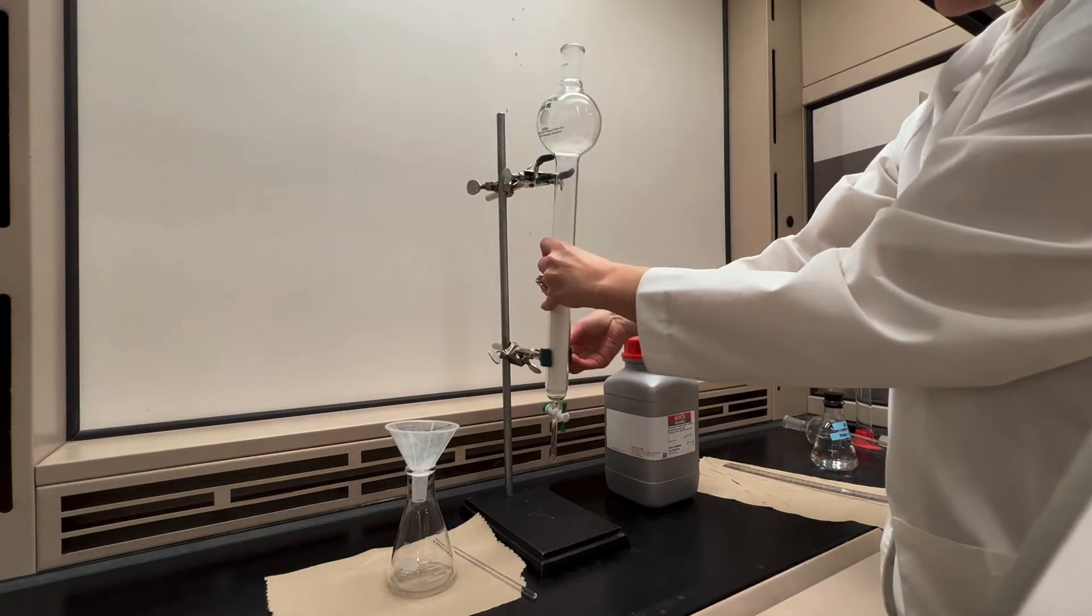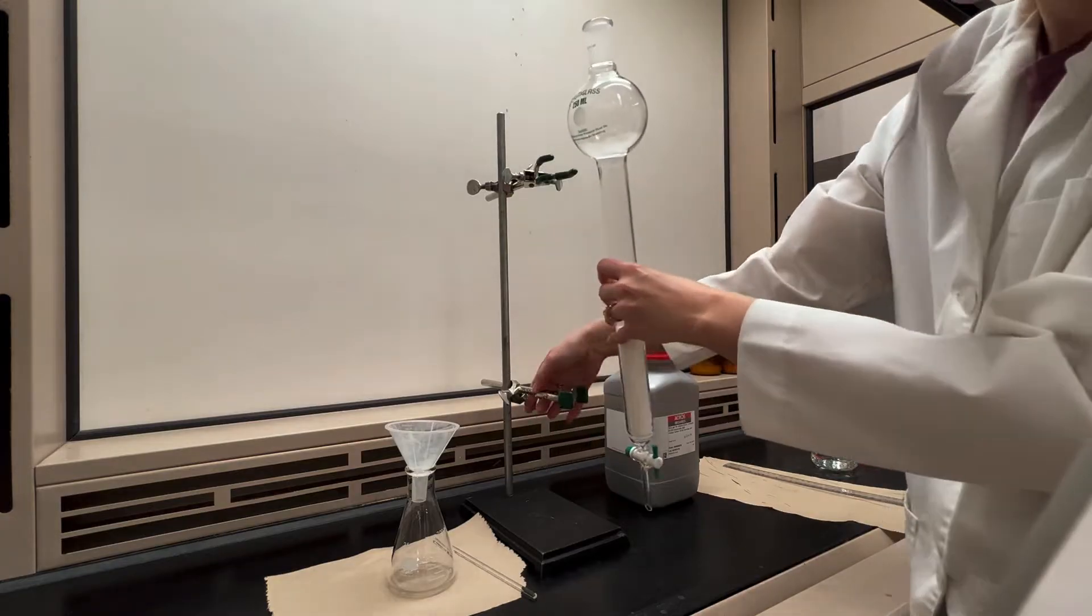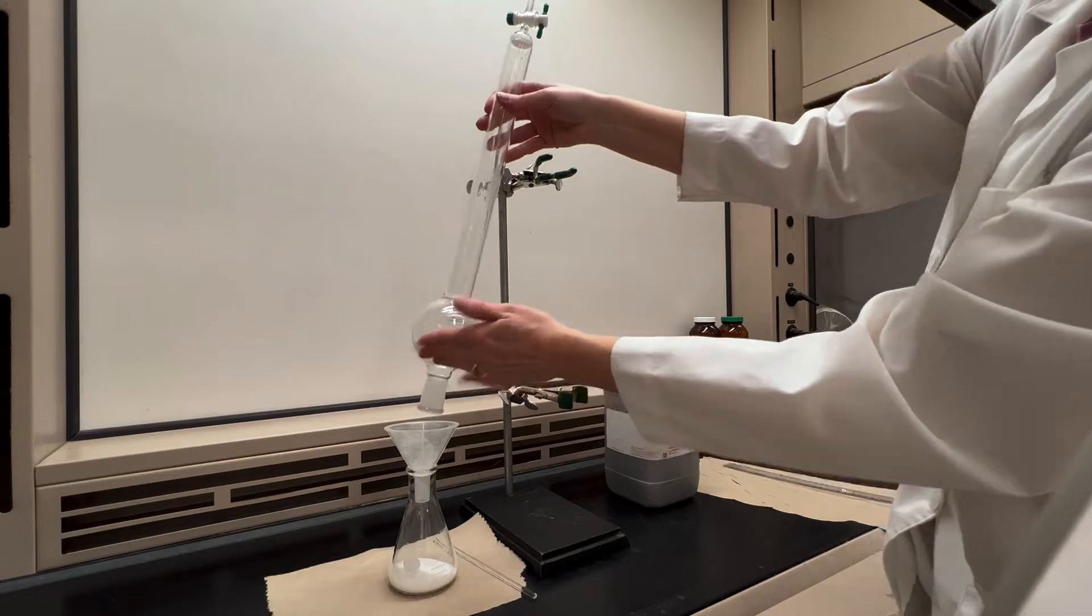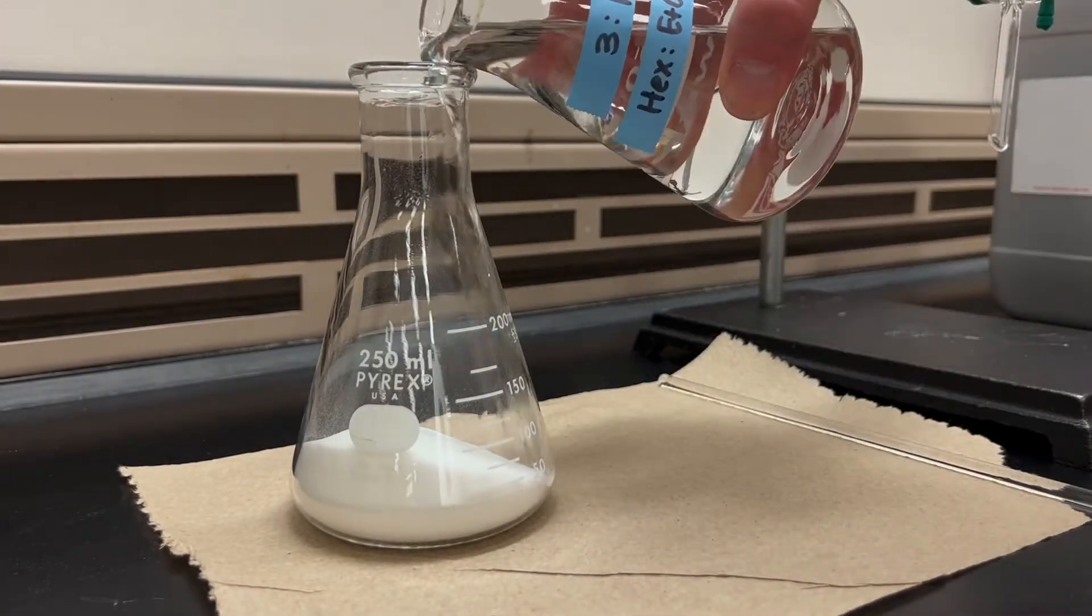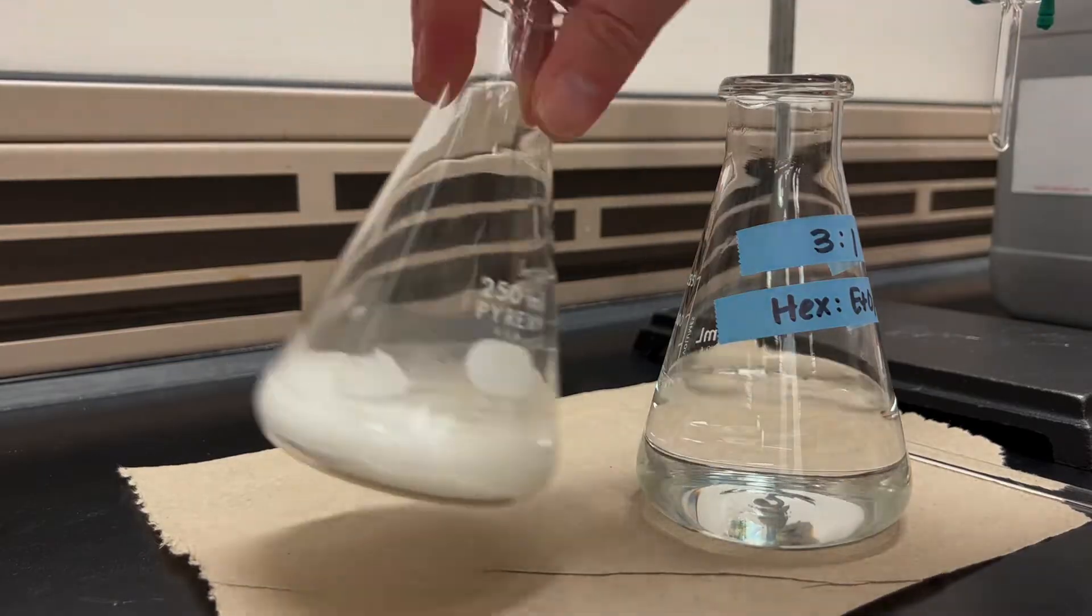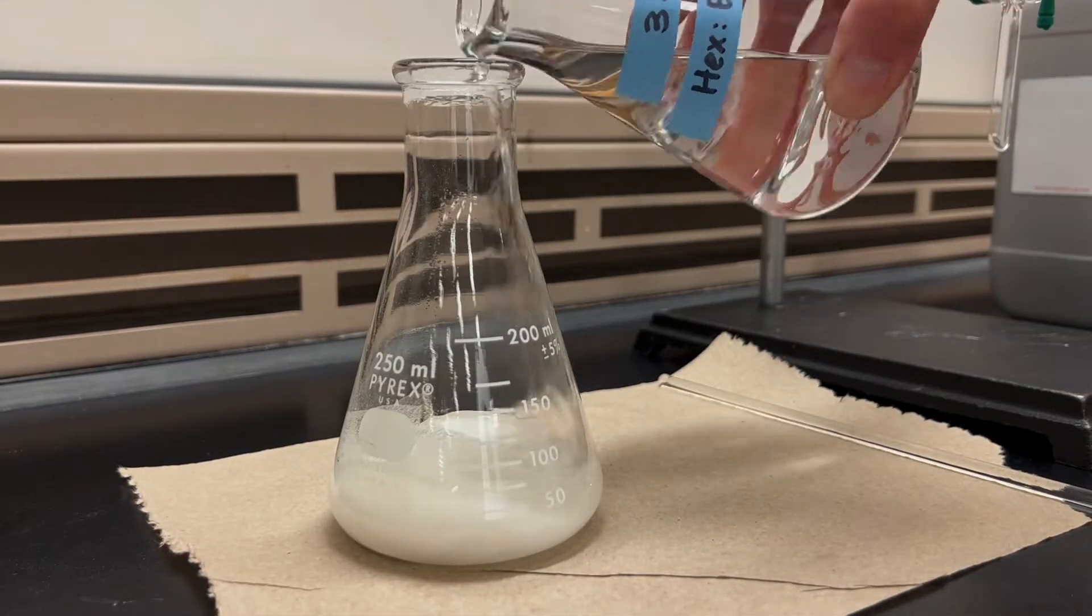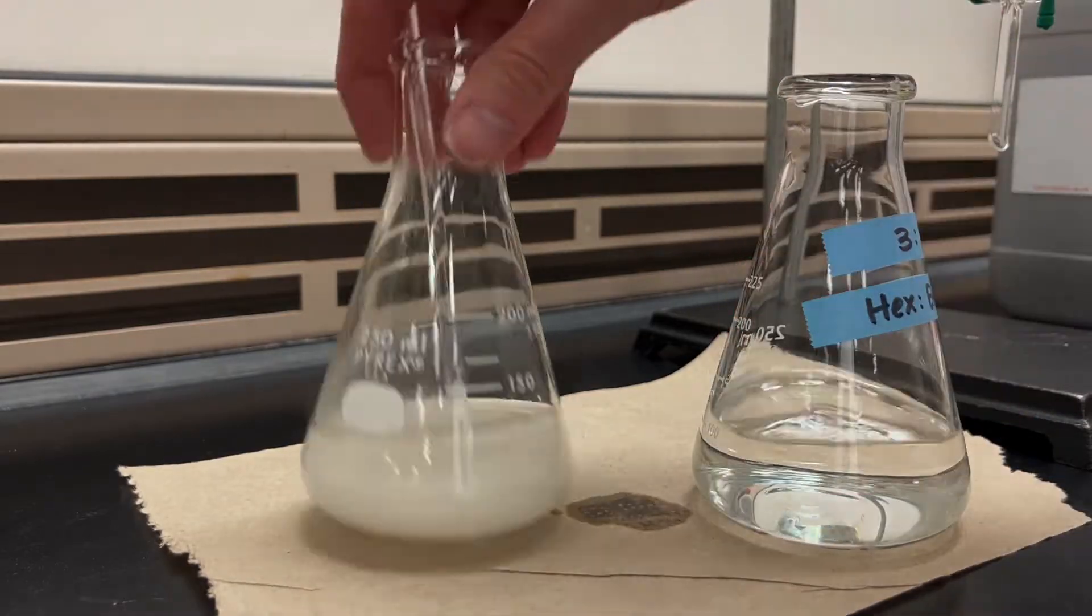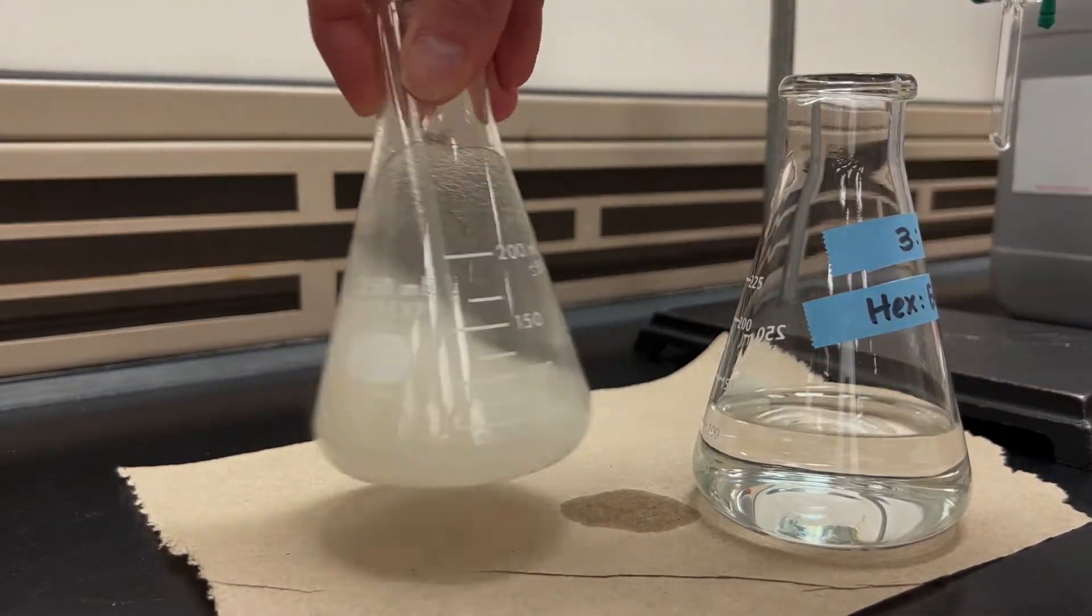I'll next transfer that funnel to a large Erlenmeyer flask and pour out the silica. Then I'll make a slurry with the silica gel by adding some of the solvent that I plan to use on the column. Just pour some in, give it a swirl, you might even use a glass stirring rod to help stir the mixture, but add enough solvent so that it's a pourable mixture.